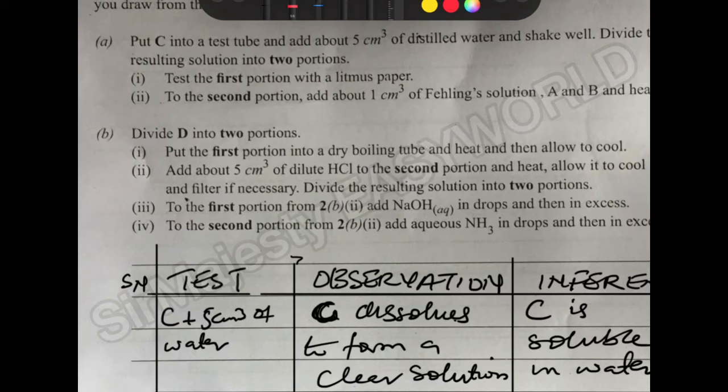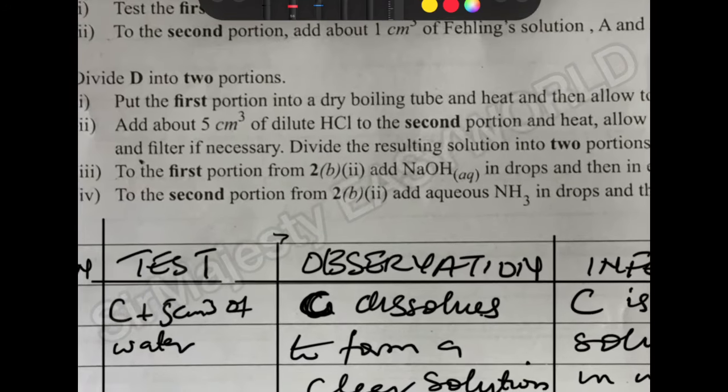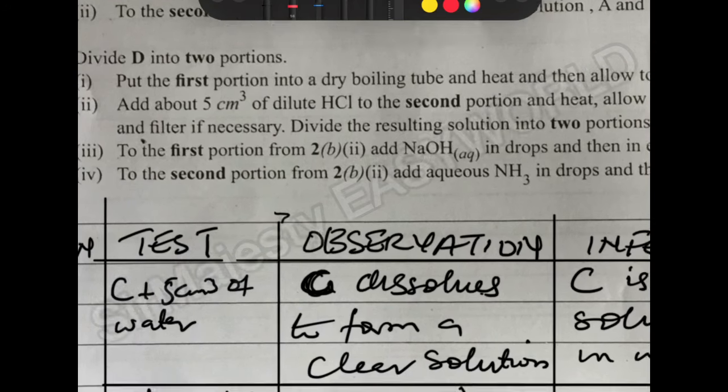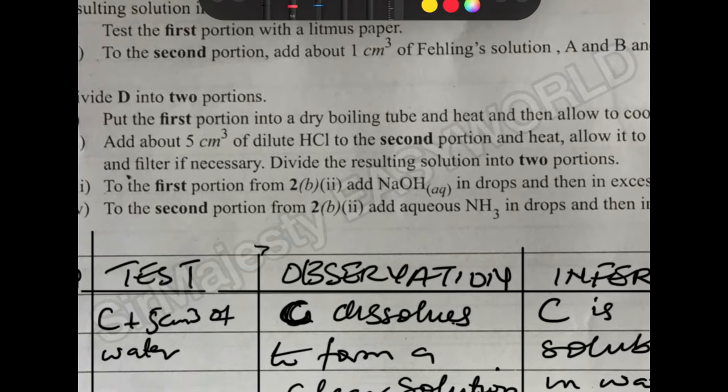So though they said filter if necessary, fine. But what if the HCl provided was too strong, so that it will dissolve the whole zinc oxide and there won't be any filtration? Because D is probably zinc oxide and C is glucose powder.